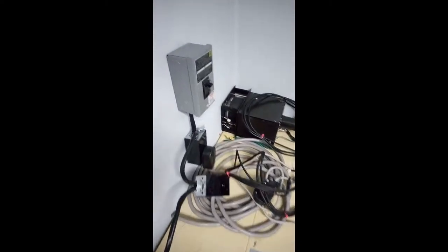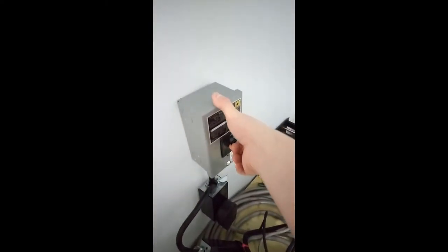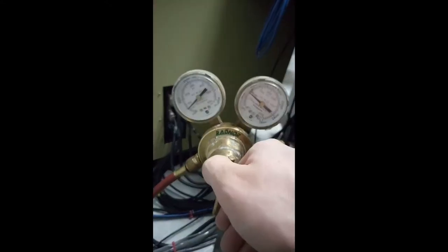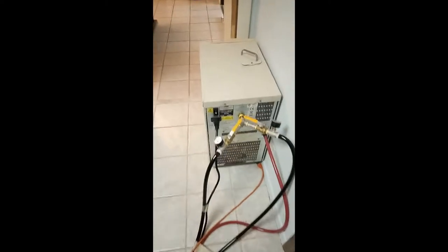So for the start-up procedure, first we turn the box on the wall on. Then we turn this switch on the power supply on. We make sure our gas is set at the correct pressure. This part is going to make a little bit of noise, but eventually it calms down.